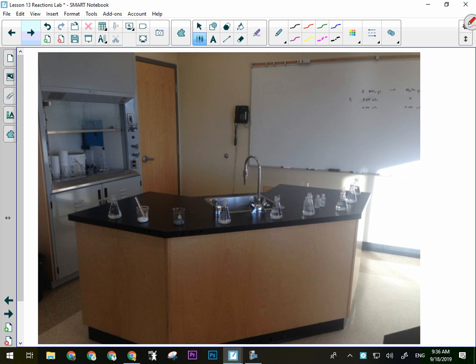All right. So the rest of them, there'll be eyedroppers in each one. I am going to actually write on the bulb of the eyedropper which thing it comes from. It is really vital that you do not put the eyedroppers back in the wrong containers. Because if you do, well, it's not going to blow up, but it'll contaminate the solution and I'll have to make it again, and that's expensive.